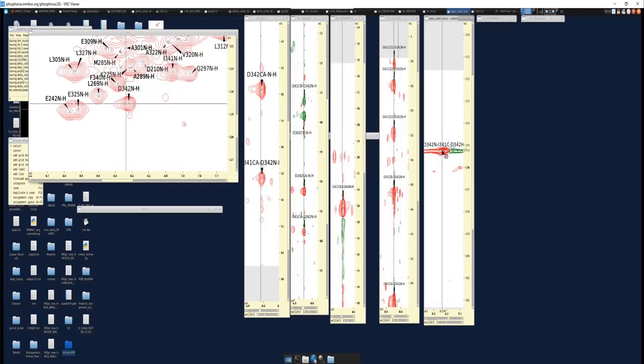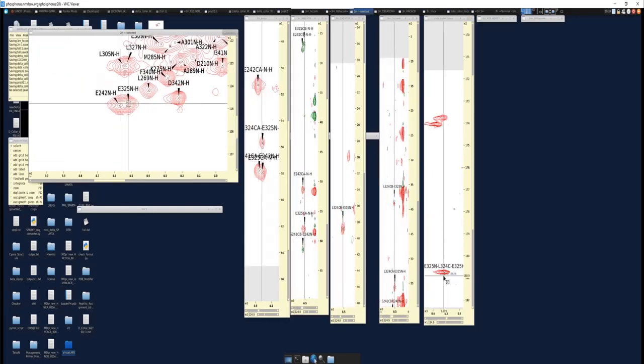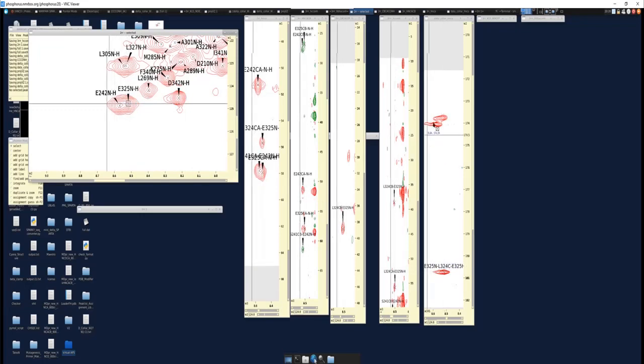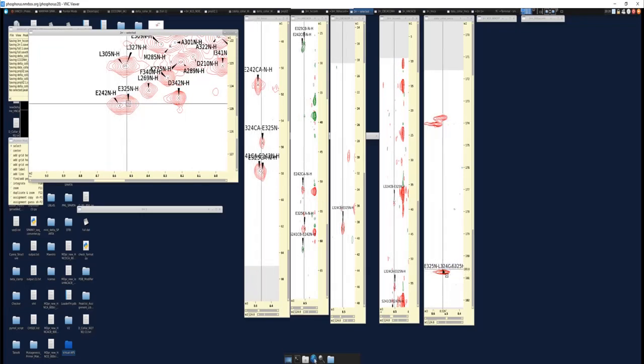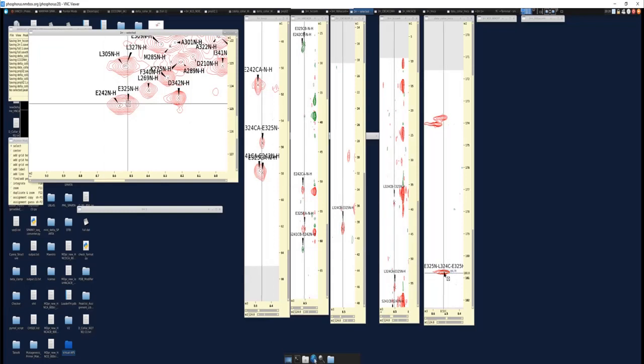using your HNCO. Right, so in this instance, if I go here, all right, the resolution is sometimes not so great, but you can see that there are different carbonyl values for these peaks. So if these peaks were, say, for example, on top of each other or overlapping, I could be able to determine which one is which by using the carbonyl itself.